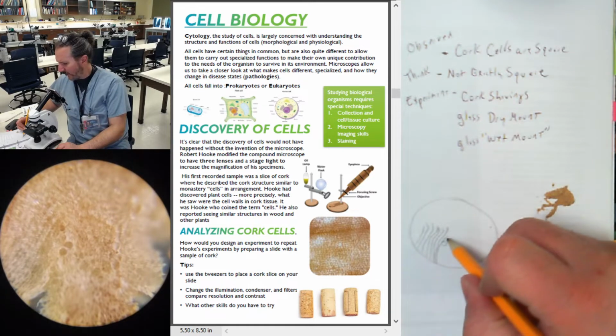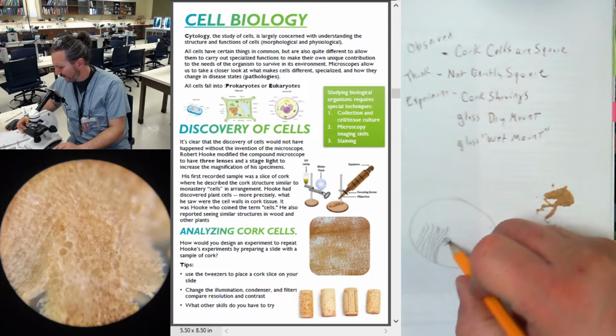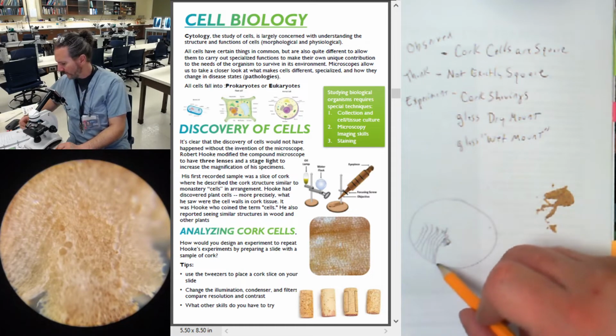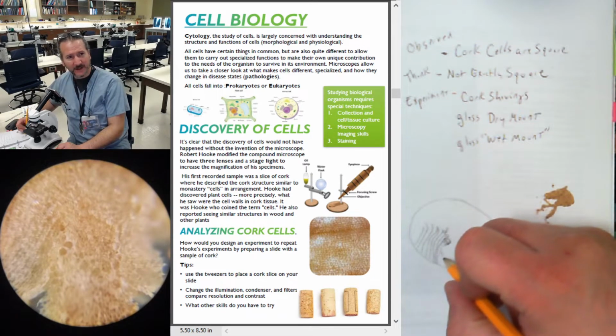See a couple of those hollow areas. So this one's actually kind of like a half moon. I have a few randoms. And I'm not going to draw every one of these. I've got a little gap down here.